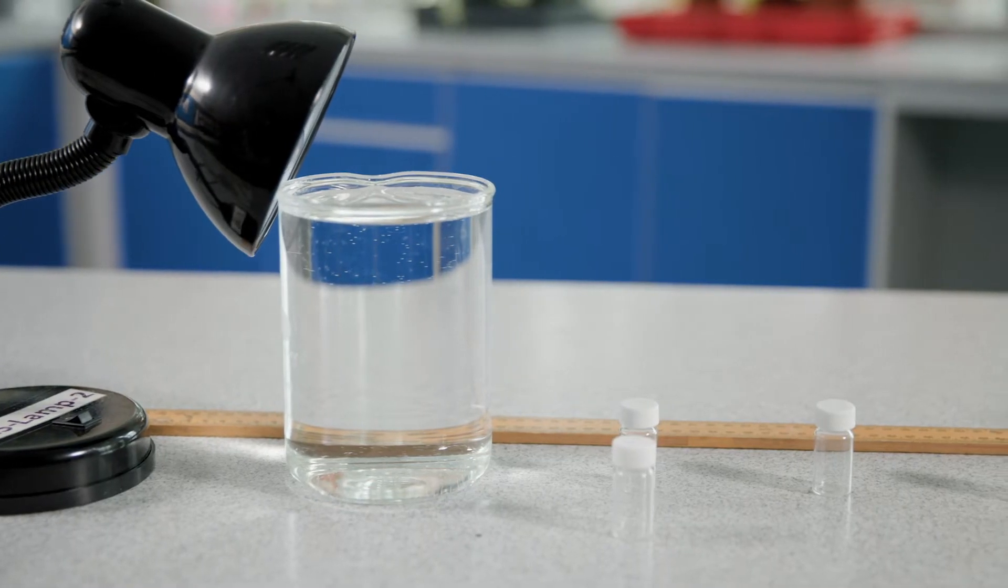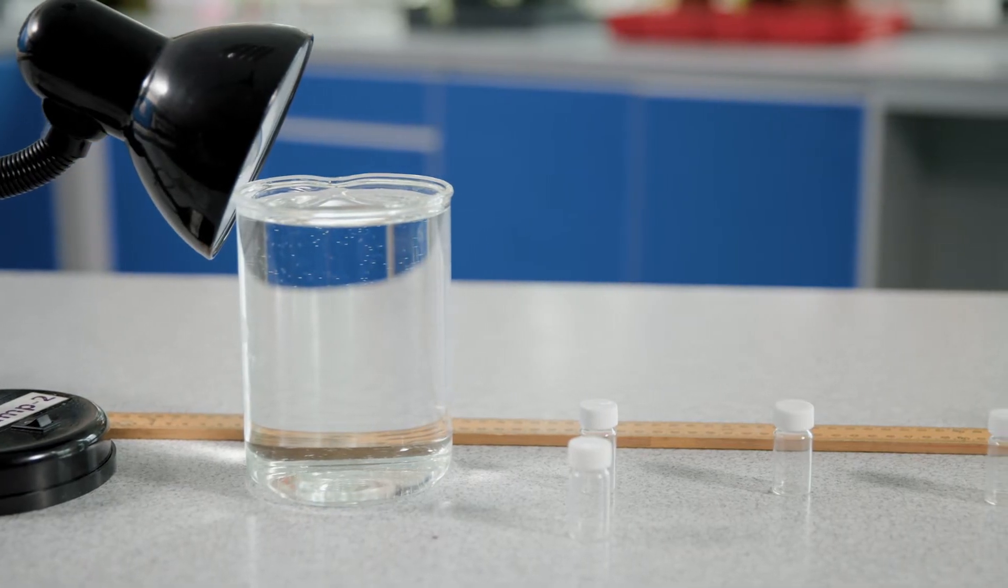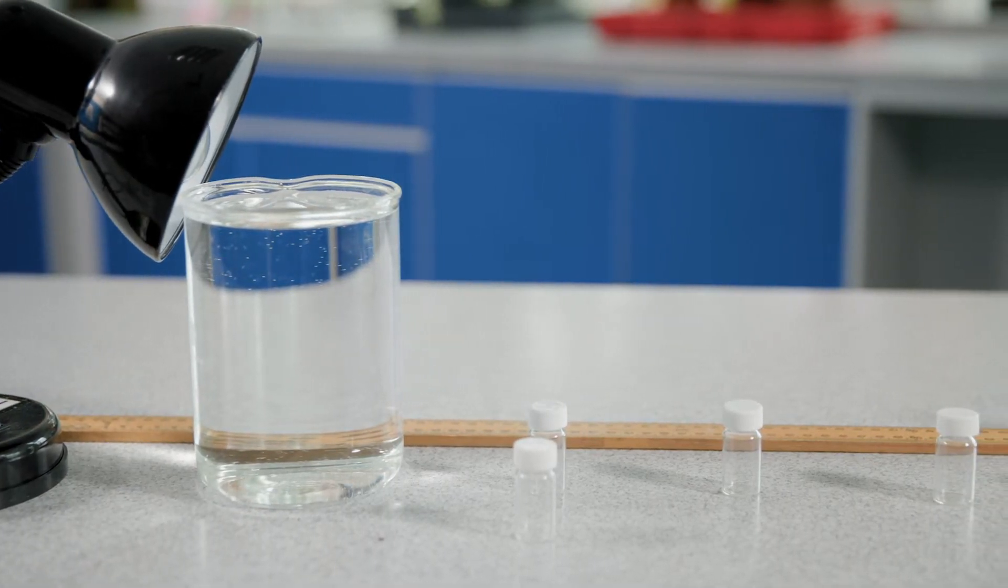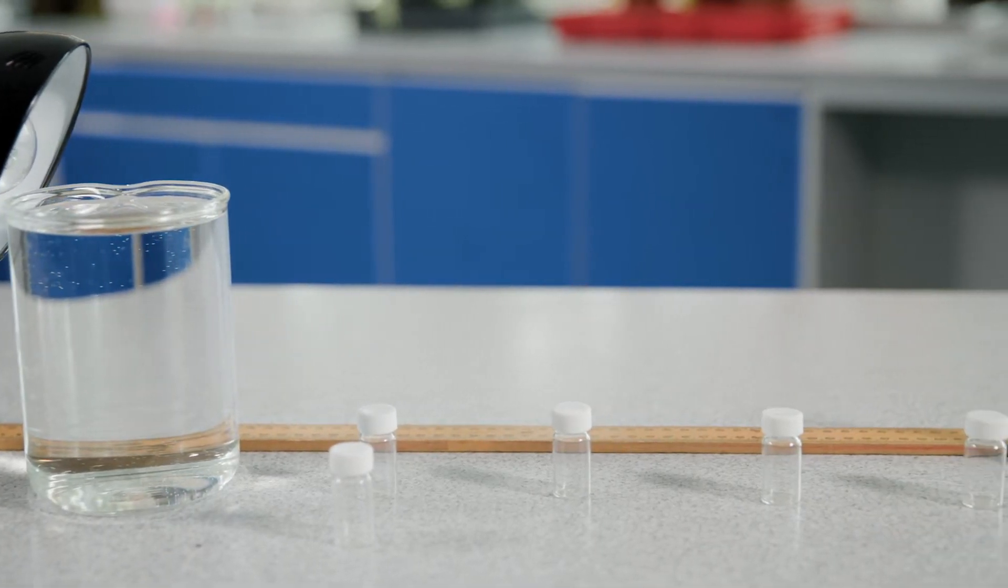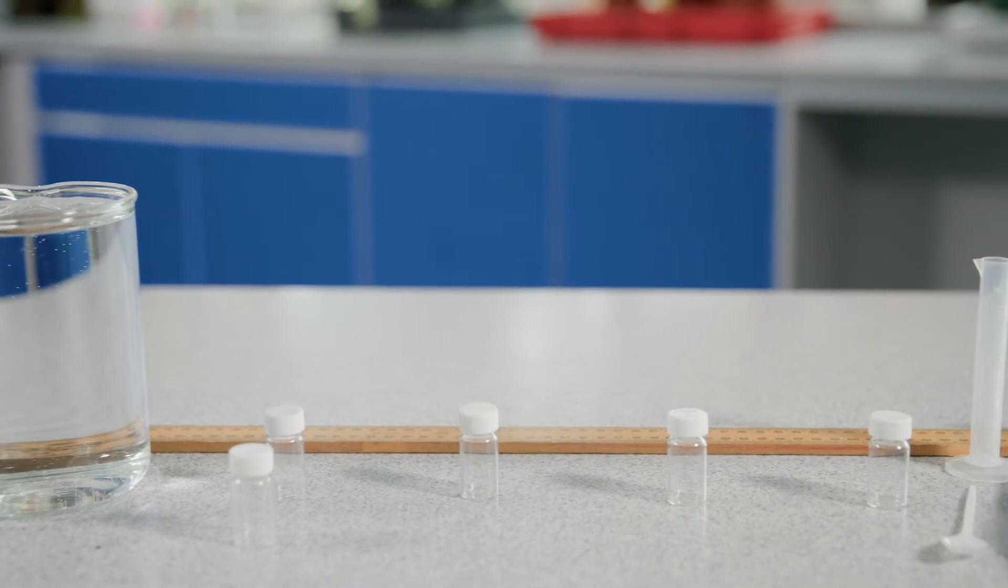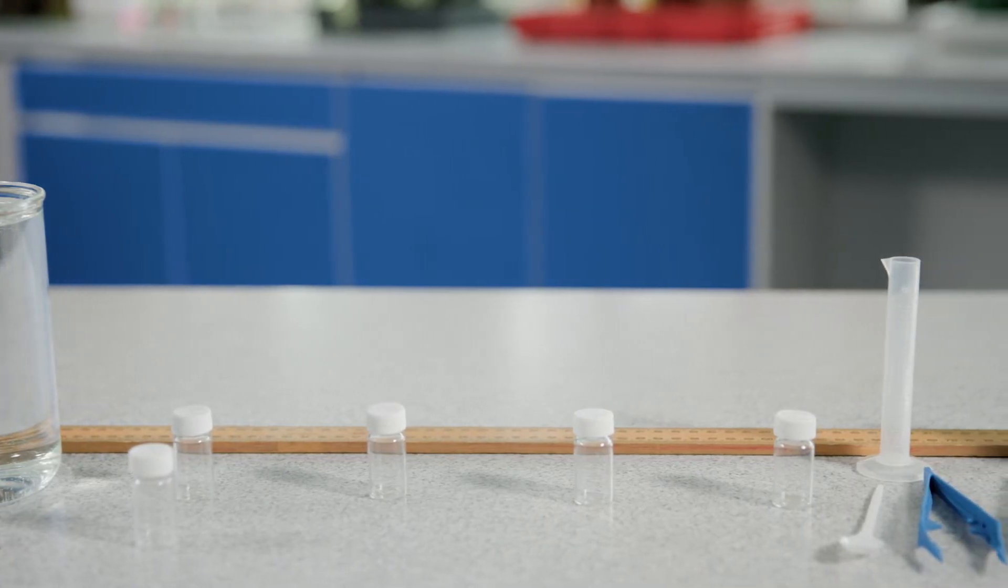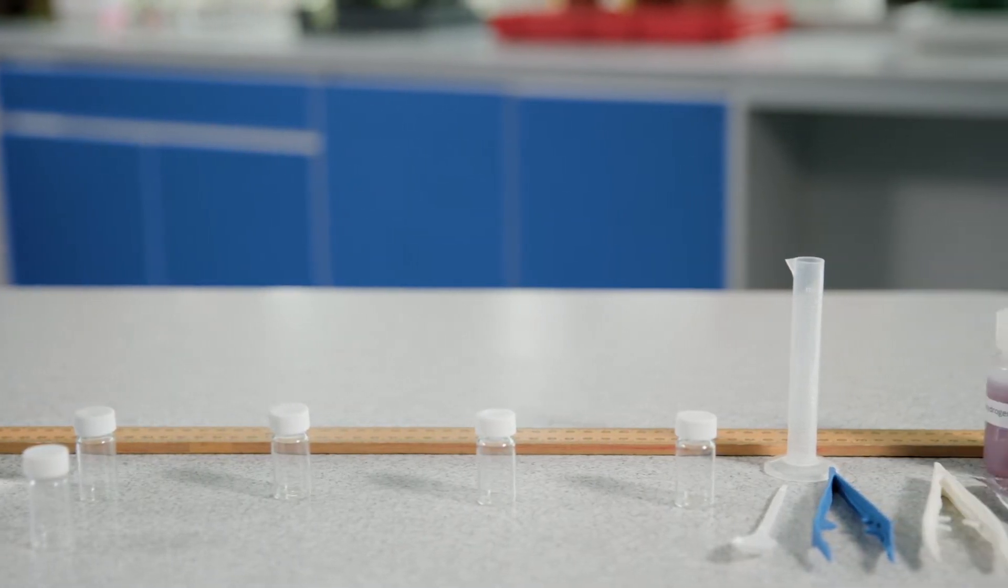Before the experiment you need to decide the different distances you are going to investigate between the algae and the lamp. In this instance I'm going to use 30, 40, 50, and 60 centimeters, but you can decide your own.